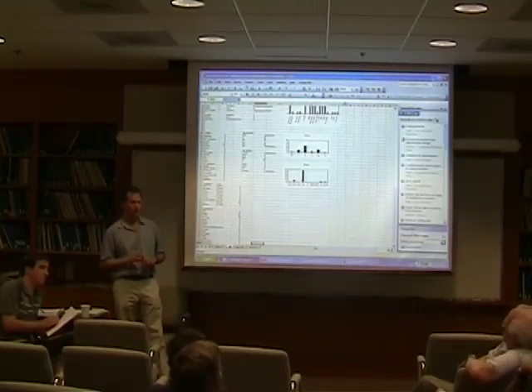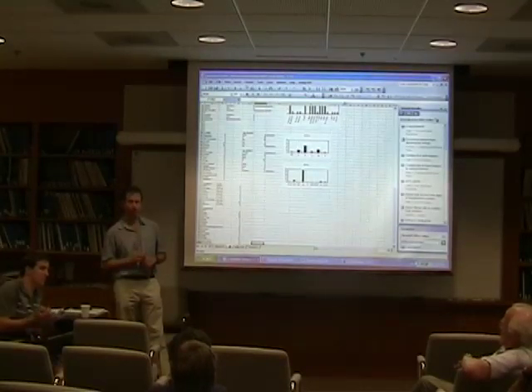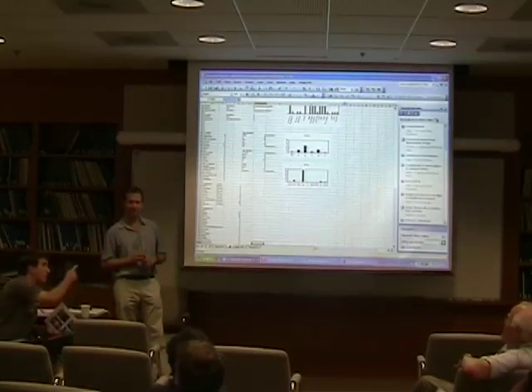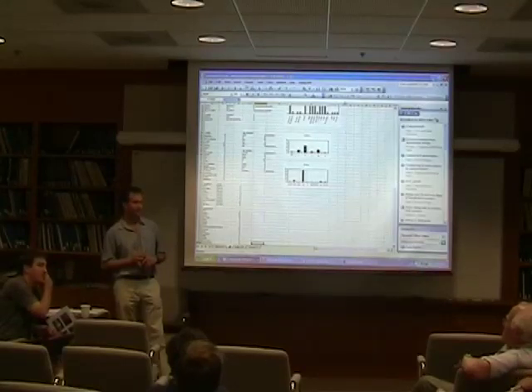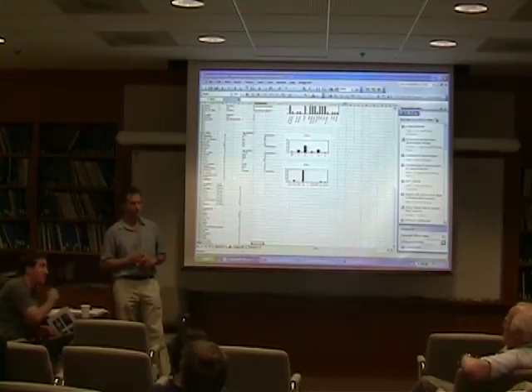If you have to limit the number of samples, I guess you'd want to use the ones that were the most successful in the past, but then at the expense of the point you just made. Yeah. Right. I think what we're looking at is a very small sample set as well, so it may not necessarily be representative that something's working because it's the best. If you had 40,000 structures, like you do for X-ray structures, that sort of data would probably be more representative of what works, as opposed to this field where you've got 100 odd structures.